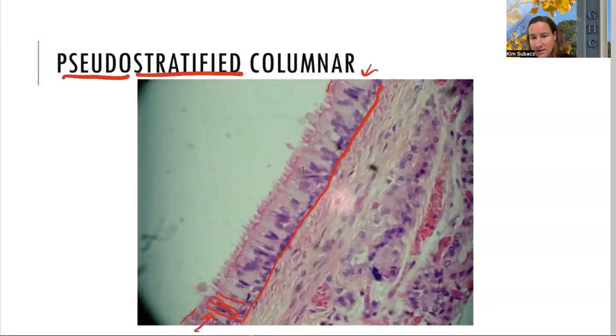And then all of this stuff right here, I hope you can make it out. This stuff that looks like pink hair is cilia. So we've got, oh, there's a goblet cell. Okay, we got a goblet cell right there. He's producing the mucus, and then all this mucus captures these particles, right? In our trachea, in our respiratory tract.